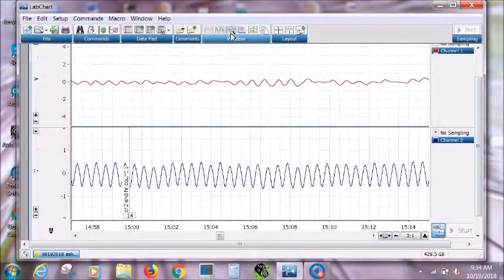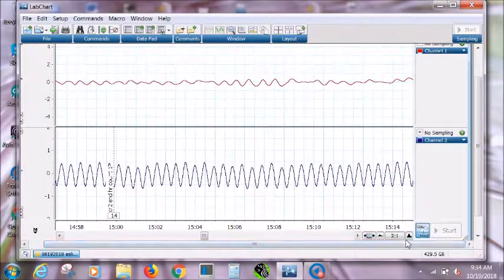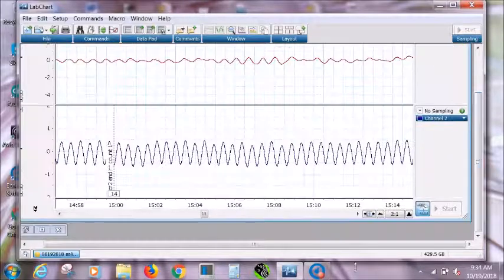I like manually zooming in on the window, but you could also take longer sections and zoom in on the bottom with the expand horizontal scaling mechanism there.